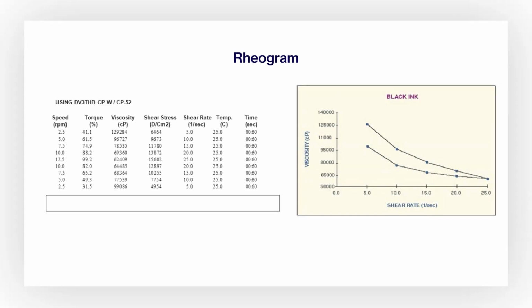Here's a graphic representation of a rheogram. An AMETEK Brookfield DV3T HB range cone plate viscometer was used with a CPA 52 cone. The cone plate geometry has defined shear rates, which results in reporting shear rate and shear stress. Data shows 5 shear rates were run, ramping up and then back down. Each step had a runtime of 60 seconds.